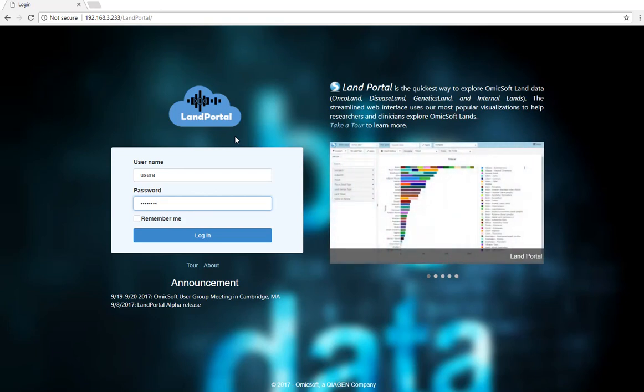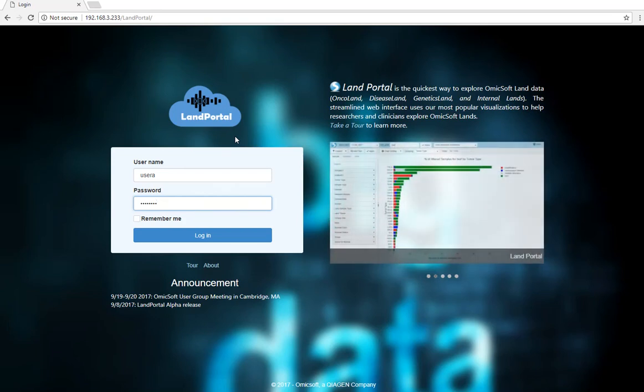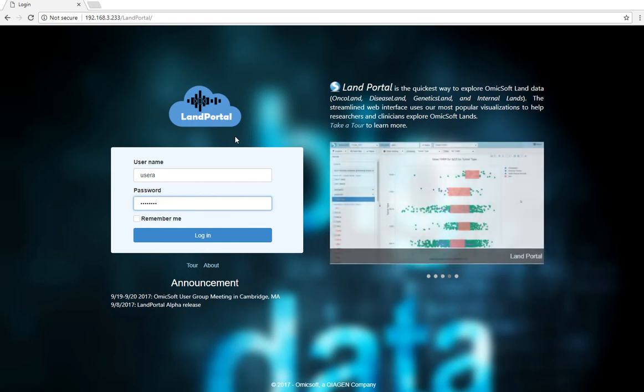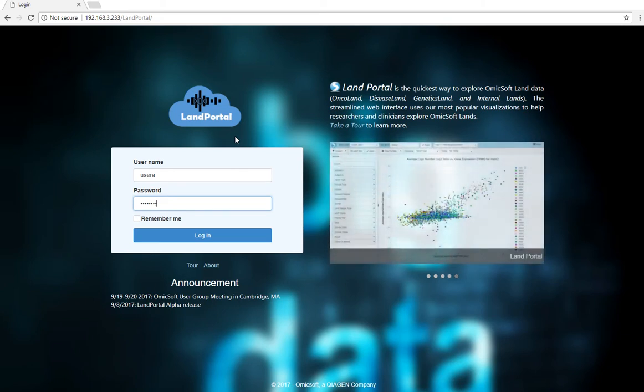Land Portal is a streamlined web interface that uses our most popular visualizations to help researchers and clinicians explore OmicSoft Lands. This video will give a short introduction to some basic features of Land Portal.